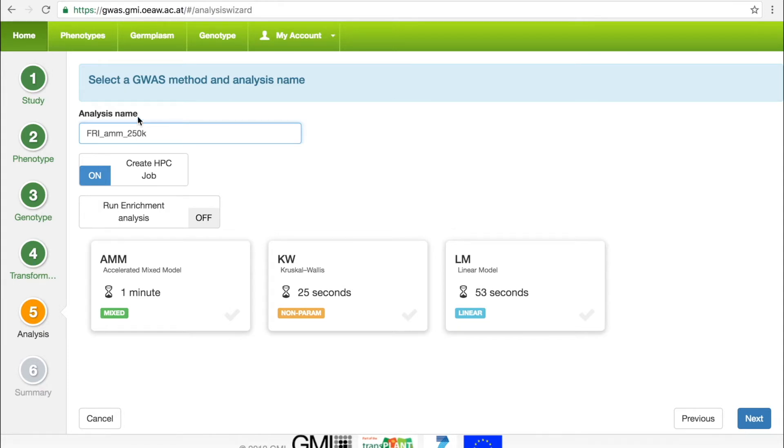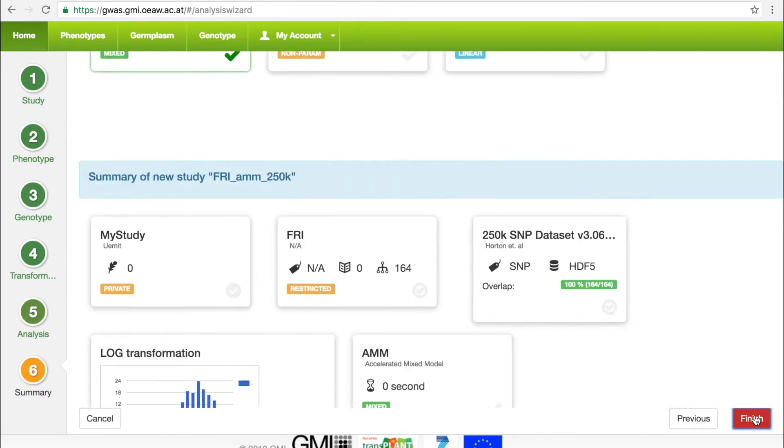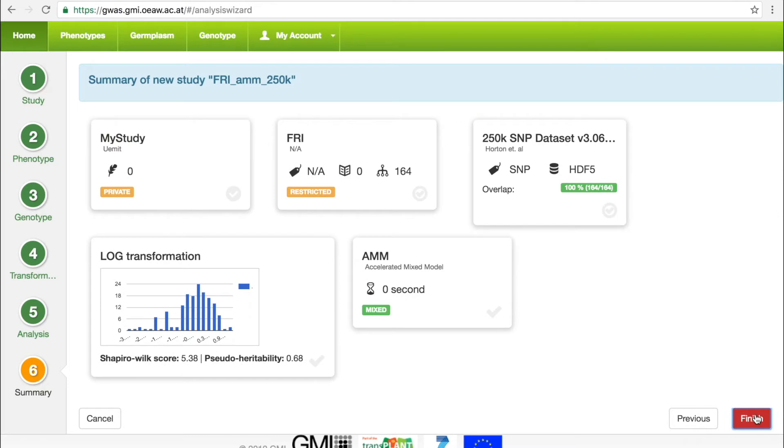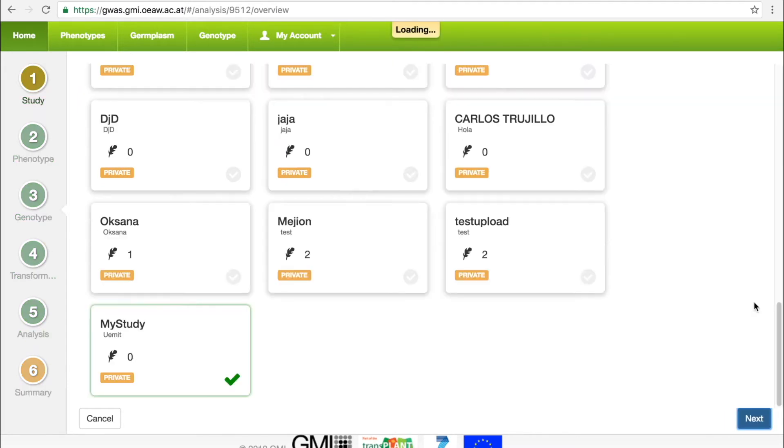The portal will calculate the estimated runtime, which is based on the number of samples in the phenotype set and the chosen genotype. In the final step, the portal provides a summary of the previous steps and settings. Once the user clicks Finish, the analysis will be stored in the database and run on the cluster.